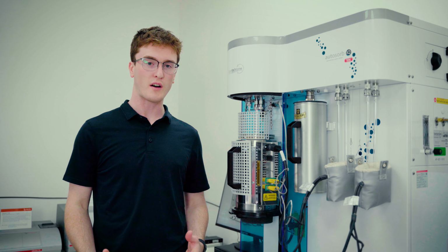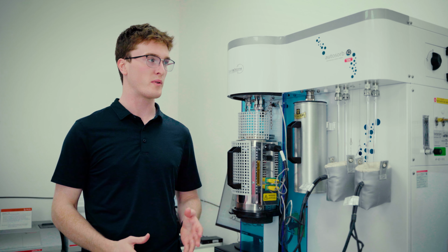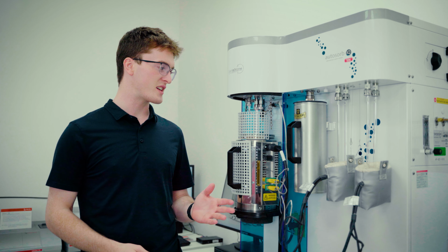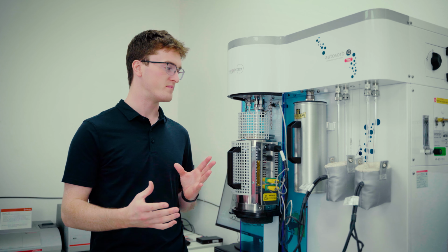For three-way catalysts and catalytic materials in general, it's also important to know how they'll interact with different gases. Often this is part of their primary purpose. These properties can be studied using chemisorption, which this AutoSorb gas adsorption analyzer is capable of. Here we have degassing stations, an integrated furnace for catalyst pre-treatment, as well as analysis chambers, all in one unit.